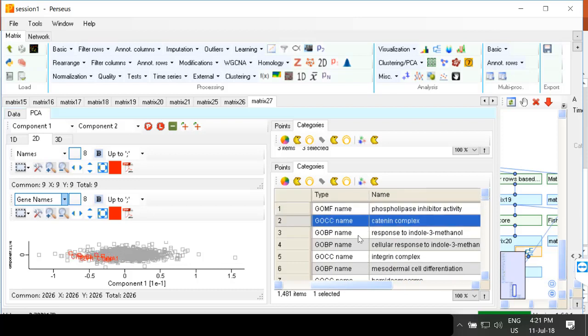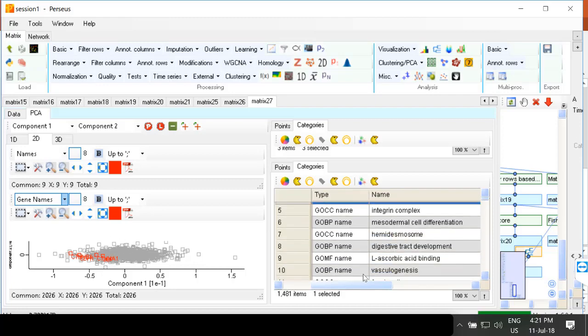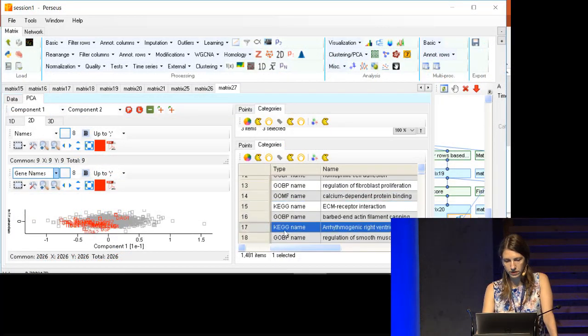And again, if you select a certain category, you can see where it lies on this loadings plot. I don't know what a bigger one is, but what you see usually is a group of proteins located towards one of the ends of the plot on the respective component. So you see that this is more going towards smaller values of the component.